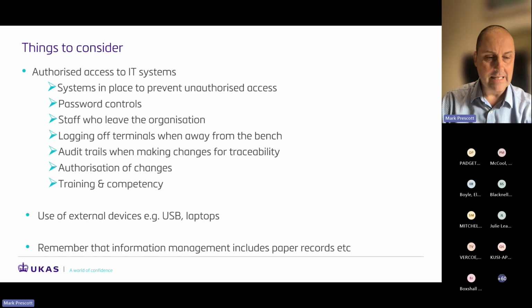Use of external devices. This seems to be getting more and more restricted now. There's a lot of places not using USB sticks anymore, and being very careful with laptops. In terms of how the standard works, I know this has been a little more focused on LIMS systems and implementing your own LIMS systems, but the standard does talk about data in general. Certainly, we at UKAS all use laptops, and we have quite strict rules in place about how to use them. We're not allowed to leave them in the car, things like that. So do bear that in mind as well.